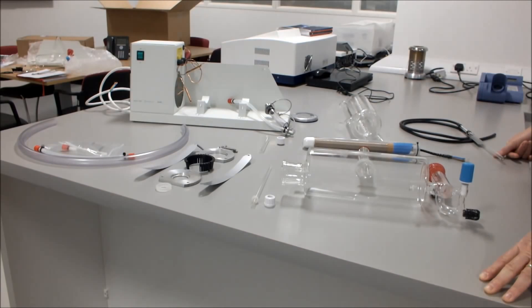This video is about the installation of the Stuart Distinction D4000 water still.